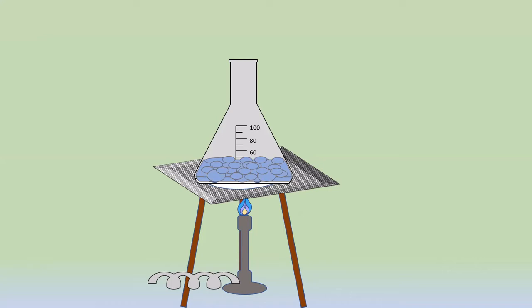And what is expected at the end of alkaline hydrolysis of ester? I started with the ester, that was this, right? So what am I going to get? I'm going to get the salt of benzoic acid.